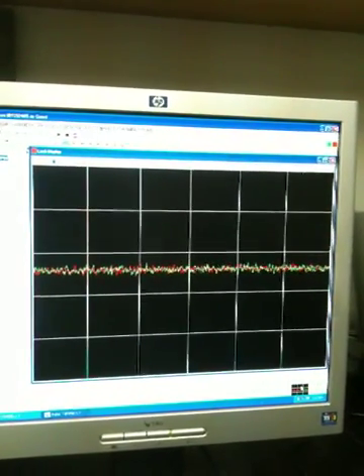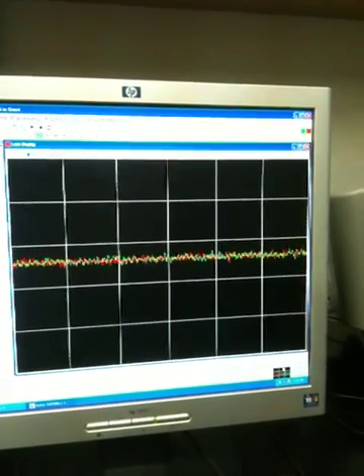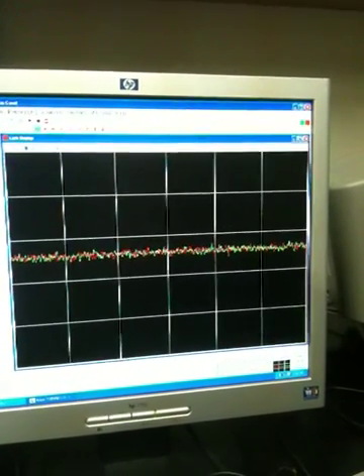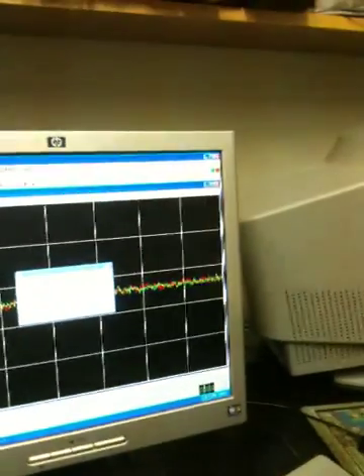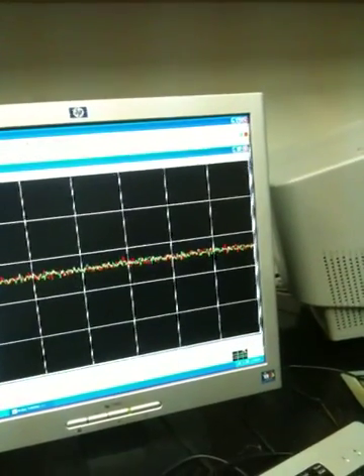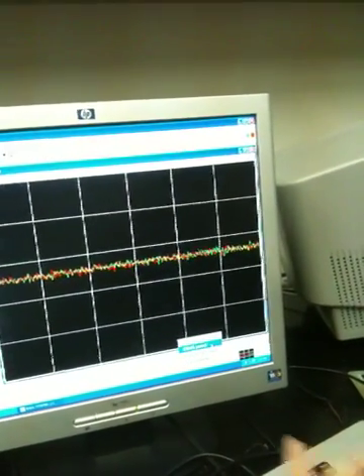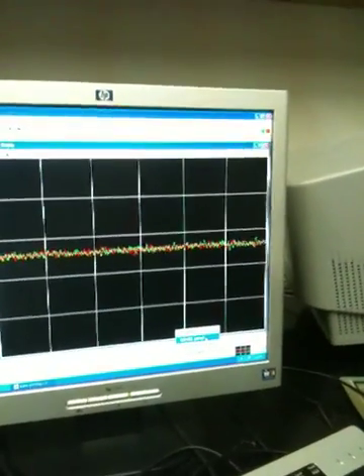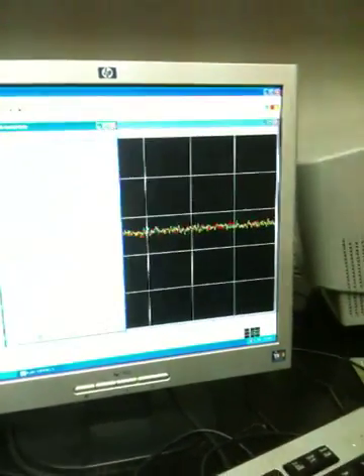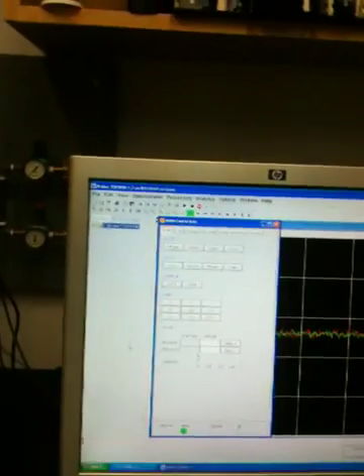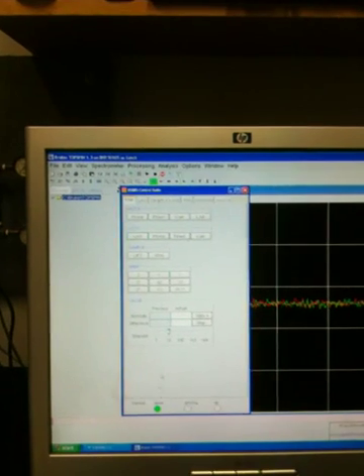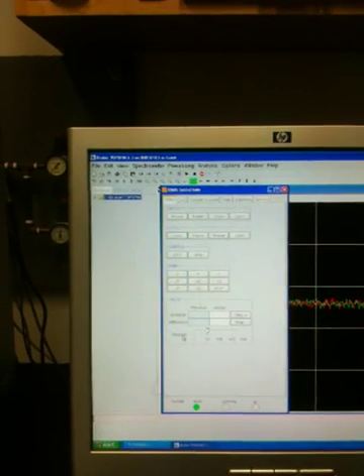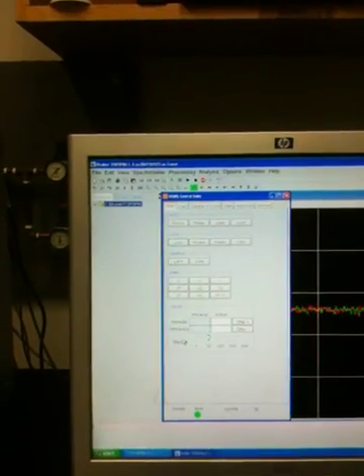I'm going to now shim. To shim, I click on this lockbox here. I do a right-click on the lockbox, and when I right-click, I get this little subbox that says BSMS panel.